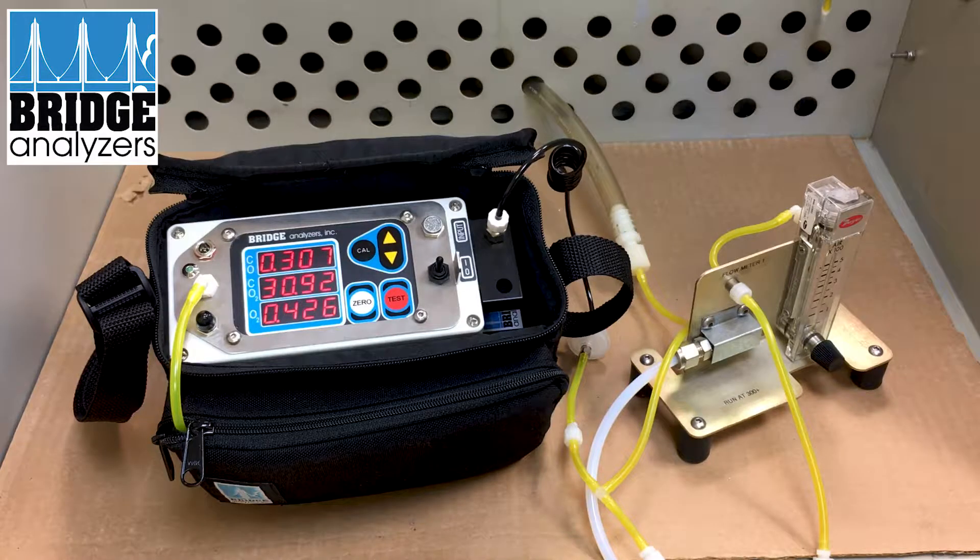You'll see the readings getting stabilized. You'd want to have this analyzer on long enough to make sure that you have stable results and stable temperature internally. Once we have stable oxygen and CO2, we can go into calibrate mode. Right now the oxygen sensor is still getting sensitized to very low oxygen, so we're going to let this analyzer run for a little bit on gas and then pick up the calibration at that point.